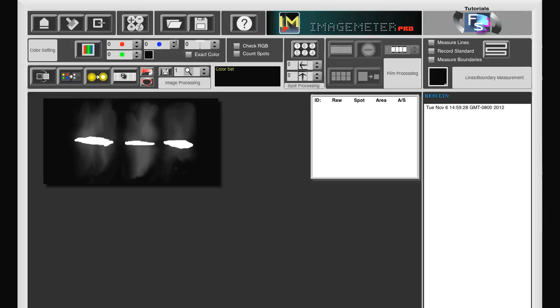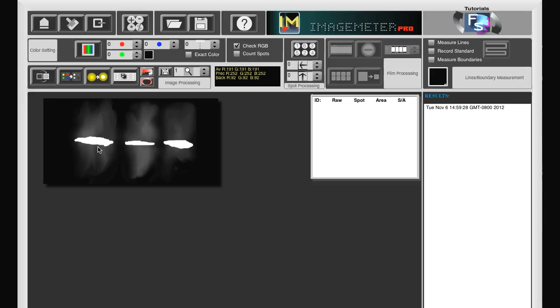We check the checkRGB box to determine the RGB values of the band. We create a rectangle around the first band. The highest RGB value is 252, 252, 252.